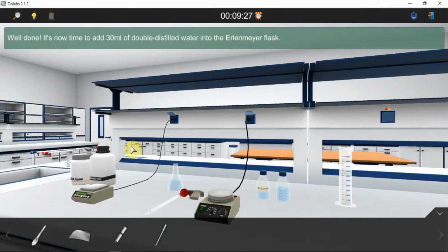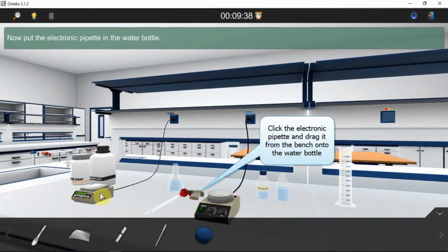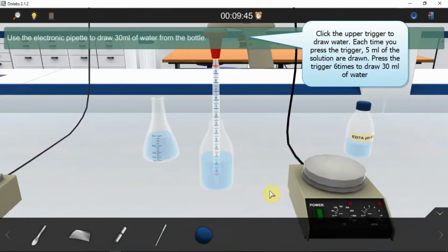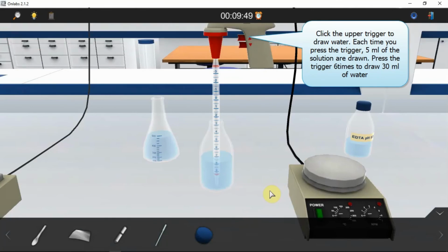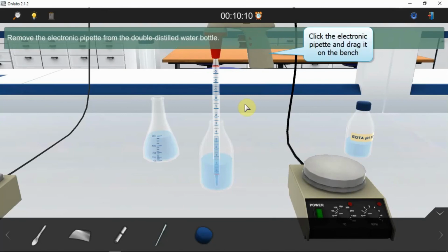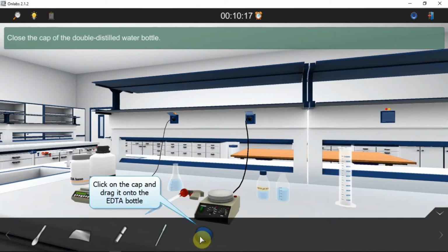Well done. It's now time to add 30 ml of double distilled water into the Erlenmeyer flask. Open the water bottle by removing its cap. Well done. Now put the electronic pipette in the water bottle. Well done. You've drawn 30 ml of double distilled water into the pipette. Remove the electronic pipette from the double distilled water bottle. Well done. Close the cap of the double distilled water bottle.